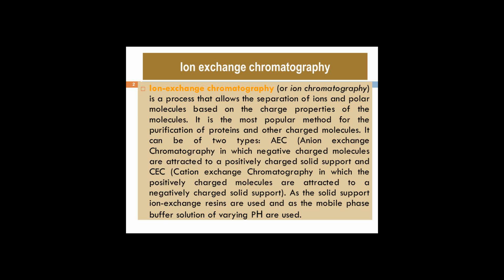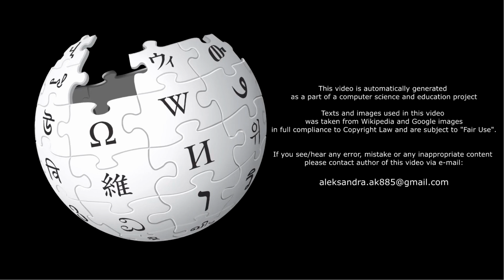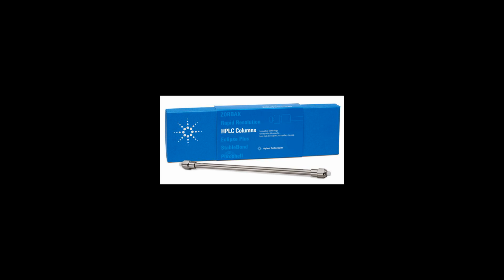DEAE Dex is a positively charged slurry that binds to the negatively charged molecules, making them elute later than the positively charged molecules in the sample of interest. This is a separation technique used widely to discover specific proteins or enzymes in the body. Unbound proteins are collected in the flow-through and/or in subsequent buffer washes.